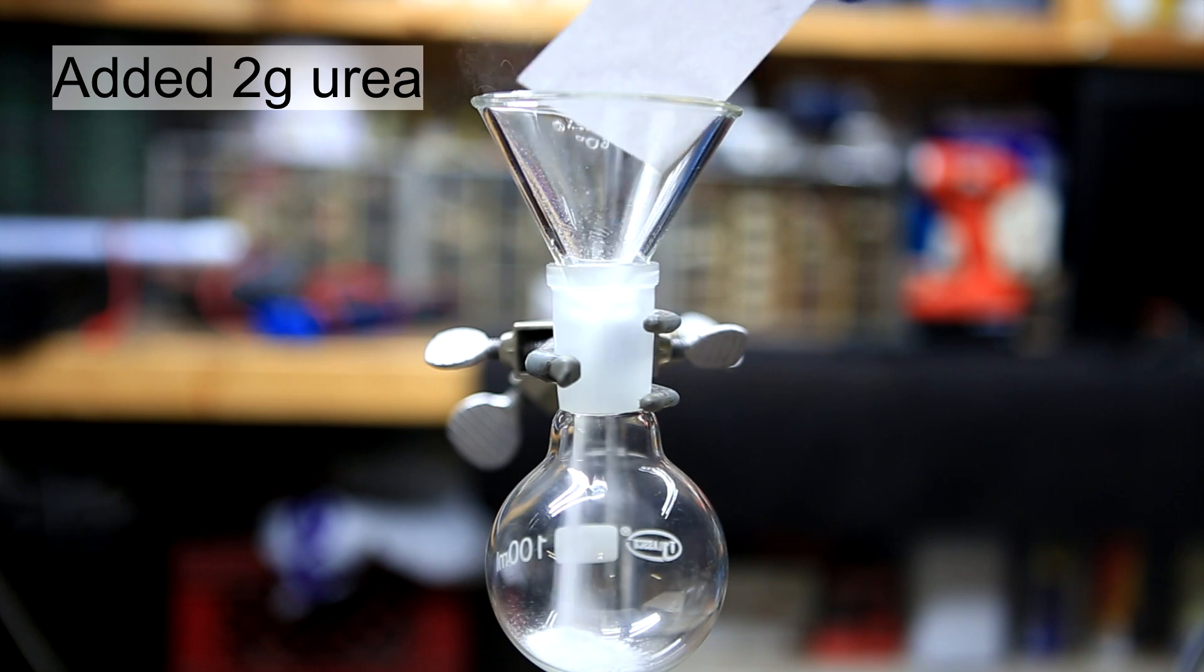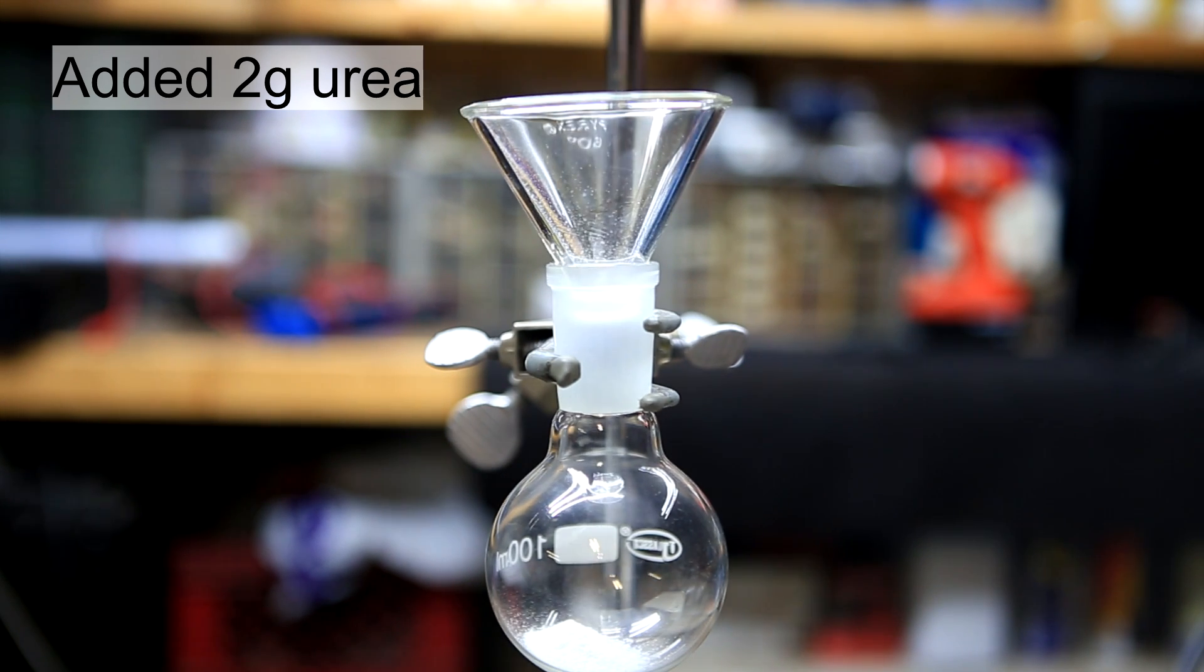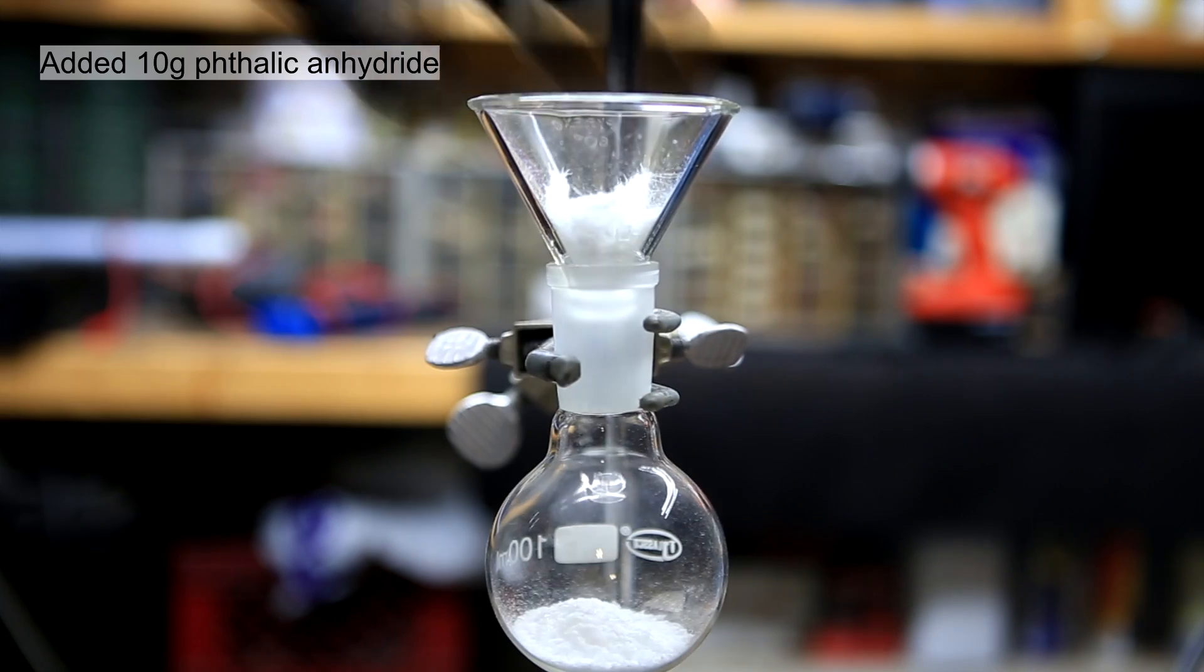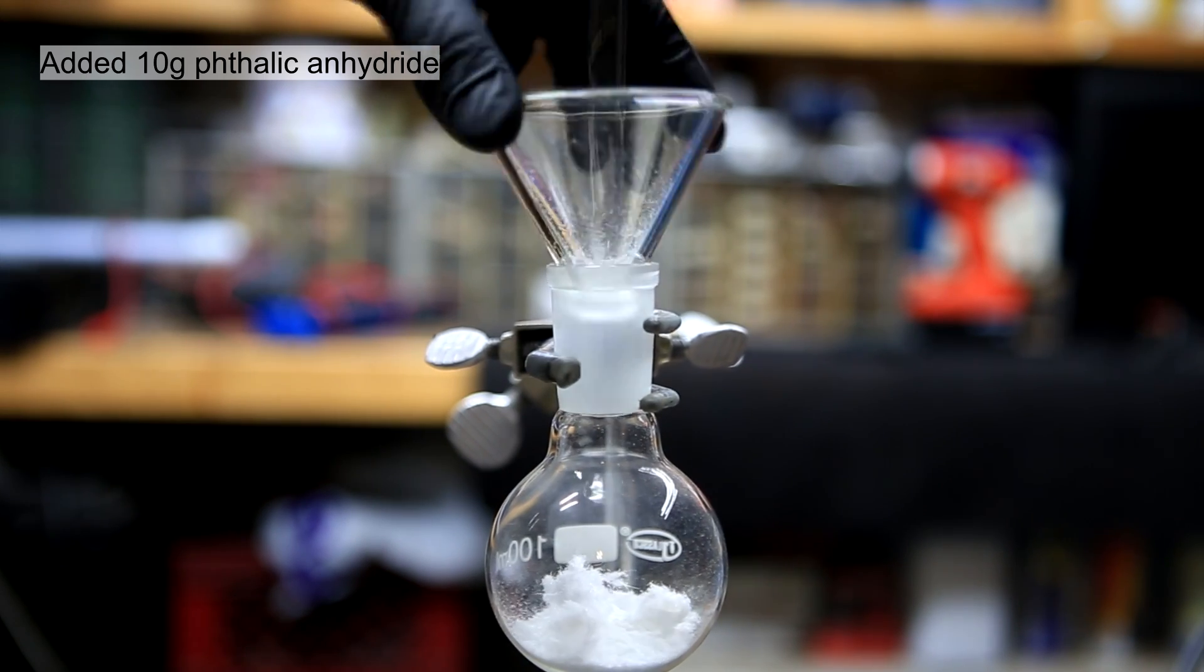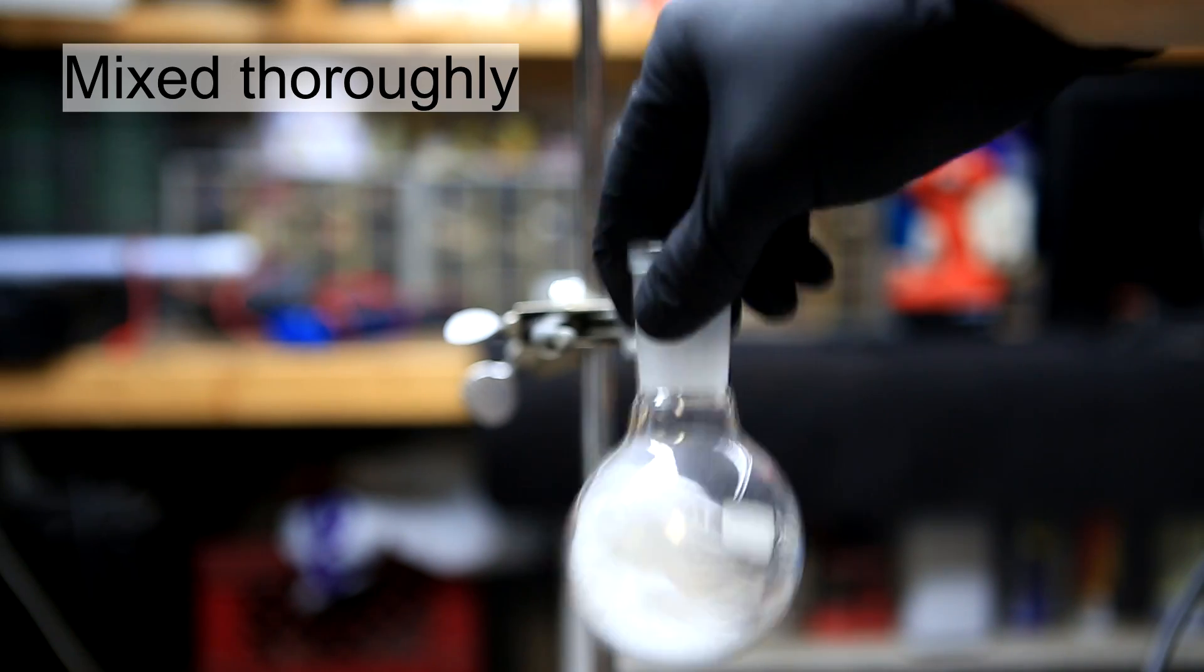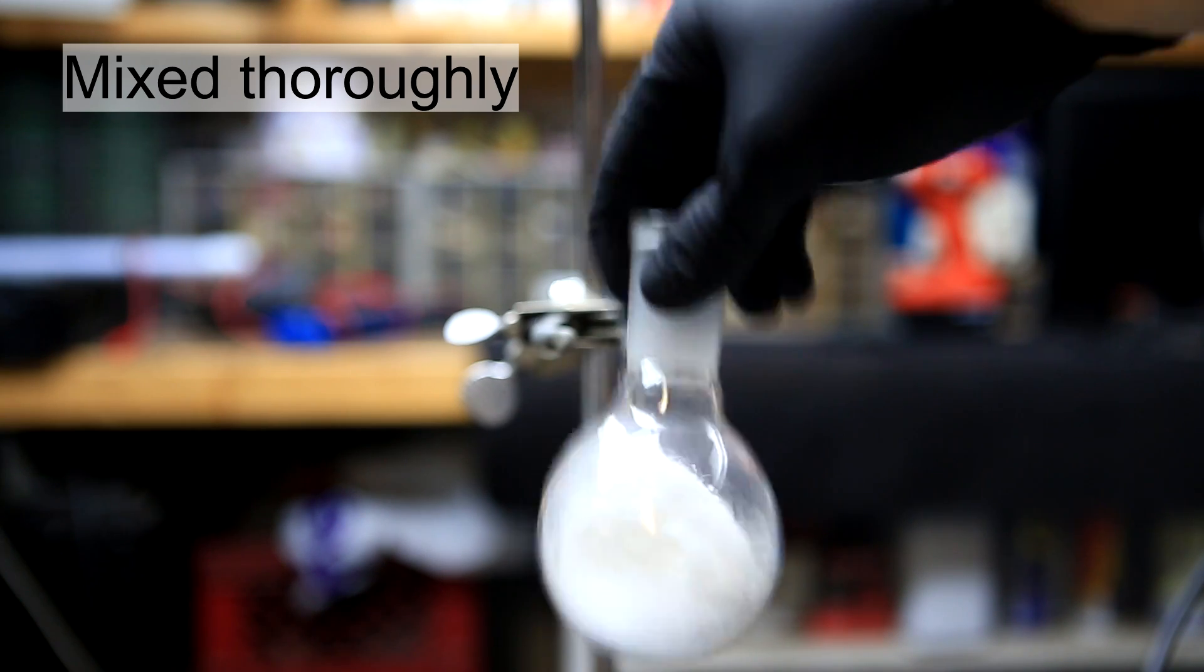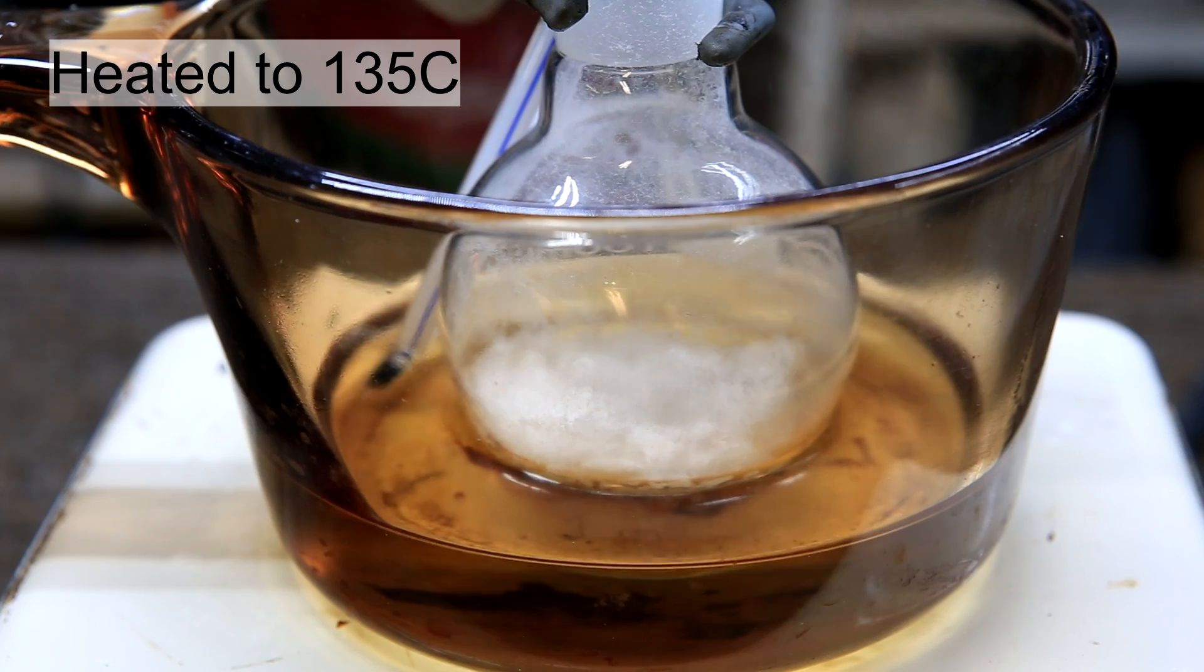2 grams of urea is added to a round bottom flask. This is followed by an addition of 10 grams of phthalic anhydride. The flask is then shaken to mix up the chemicals as much as possible. The mixture is then placed on an oil bath and heated until 135 degrees Celsius.